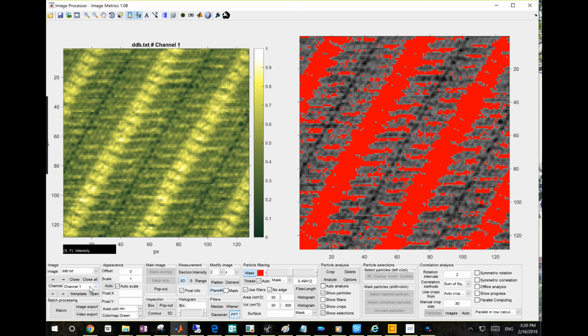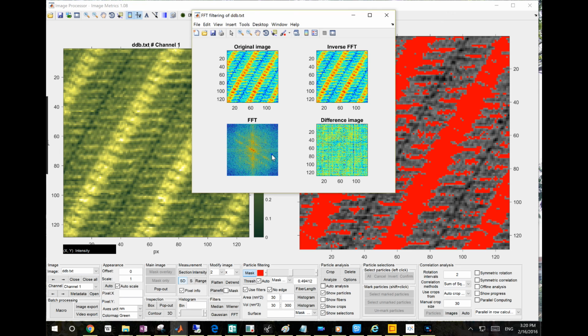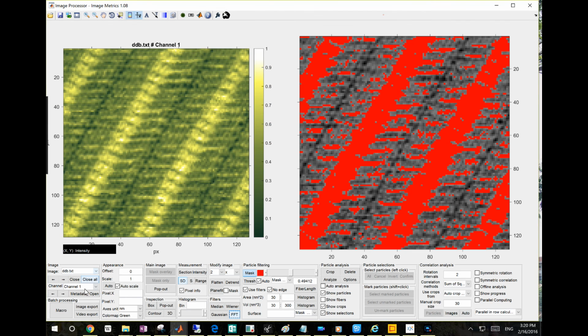Alright, I didn't confirm before the transform, so the image doesn't get modified. But if you do want to modify the image, make sure when you track this, confirm filtering and exit. That will make a new channel called modified channel in this image, and you can get the results and export them. But right now, I forgot that step. I think that's pretty much for image correction.